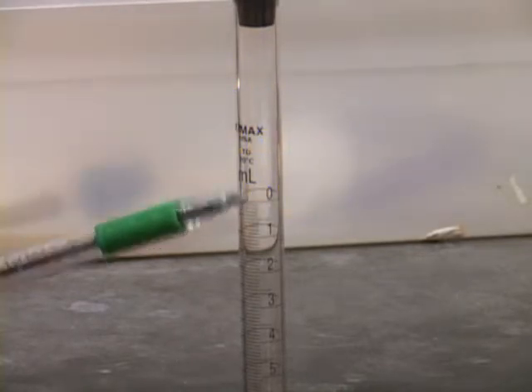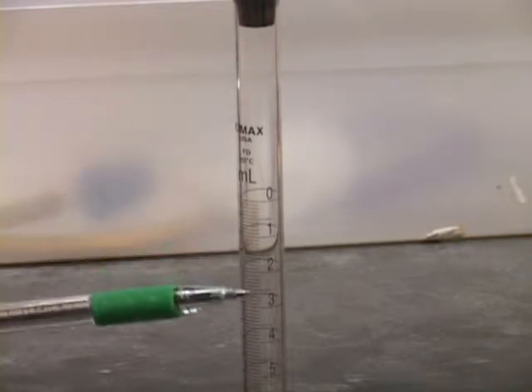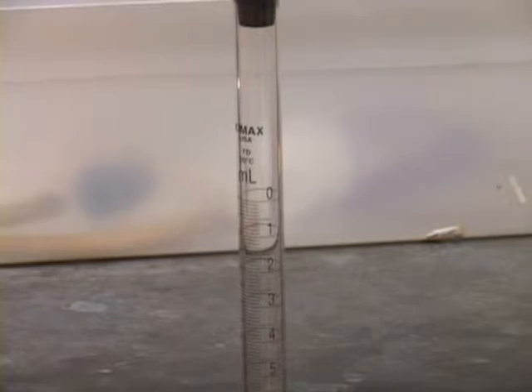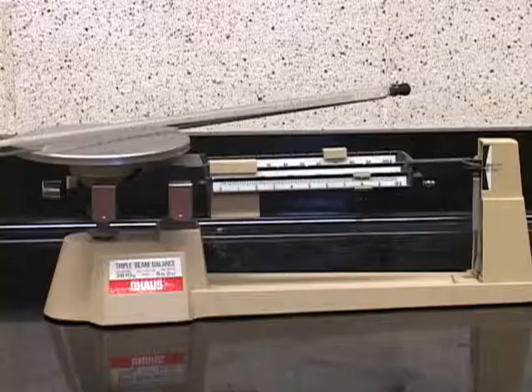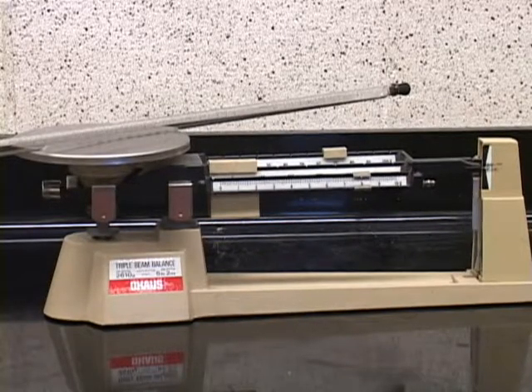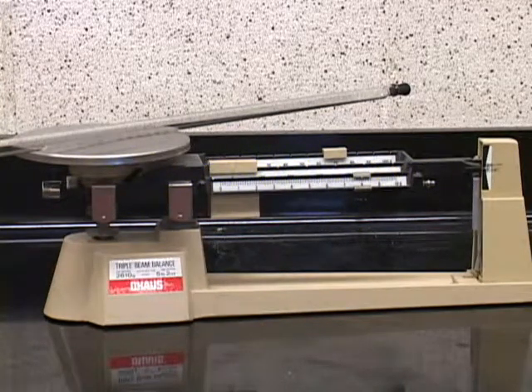As you can see, the top portion of the burette is not calibrated. You will determine this uncalibrated volume by measuring the weight of water it contains, and this weight of water can be converted to volume using the density of water. You'll weigh the empty burette on the triple beam balance. Be careful so it doesn't roll off though.